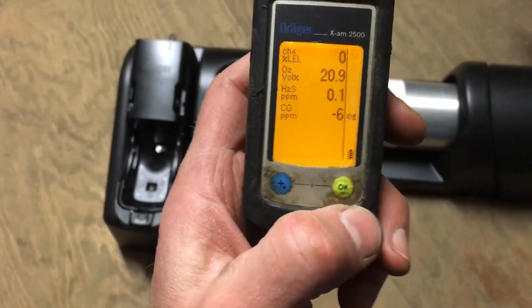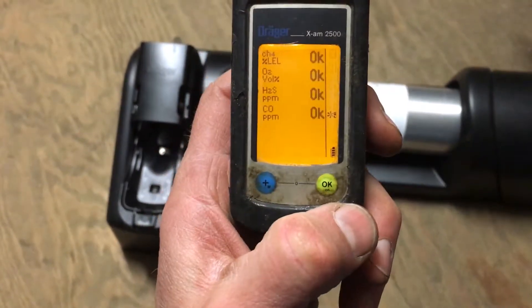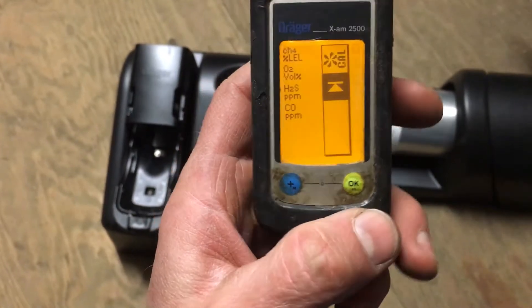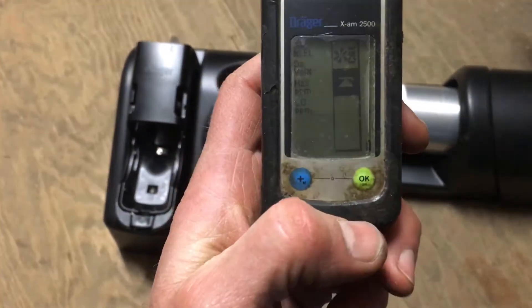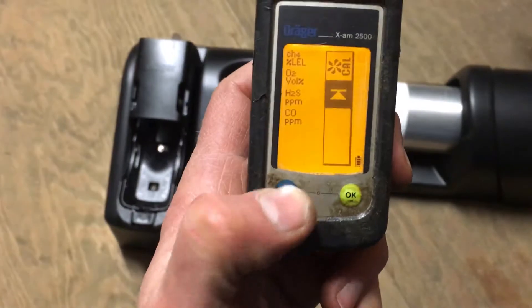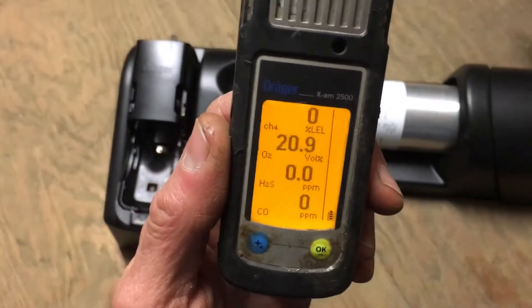Now it's doing a fresh air cal. I usually wait about five seconds, which is about five flashes. Then once it's done, push the green button one more time — everything says okay. Then the fan icon comes back asking if you want to do a fresh air cal again, but you don't, so push the blue button once to exit out.